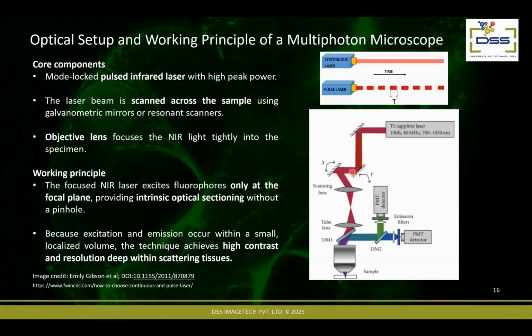These scanning mirrors are focusing light onto the sample, and there is a movement between the two mirrors. There is a raster scanning using these two mirrors, so you can scan your sample using the scanning mirrors. You can also use something called a resonant scanner to increase the speed of scanning. And what we also use here are something called non-descan detectors.